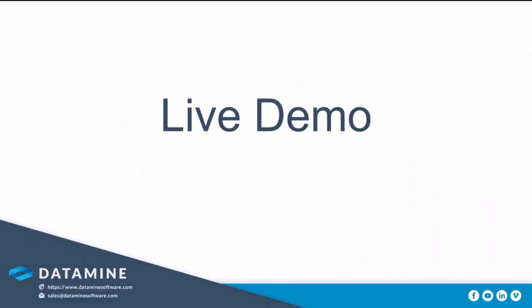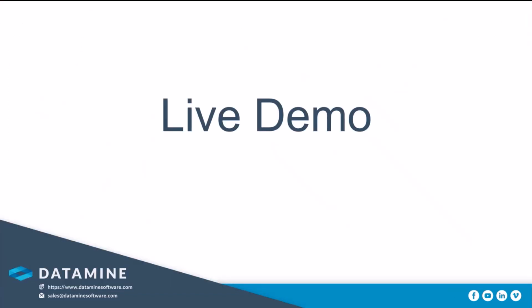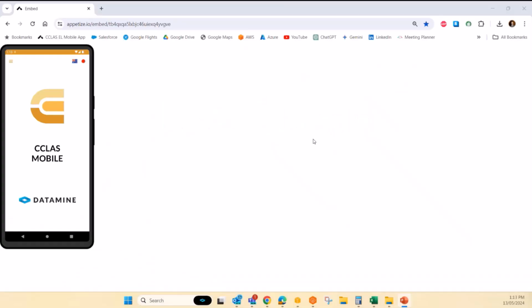Okay, so I'm just going to move into the live demo now. What I've got is an emulator emulating the application, and I'm going to run through some processes with you, and just bear with me while I end that slide screen.